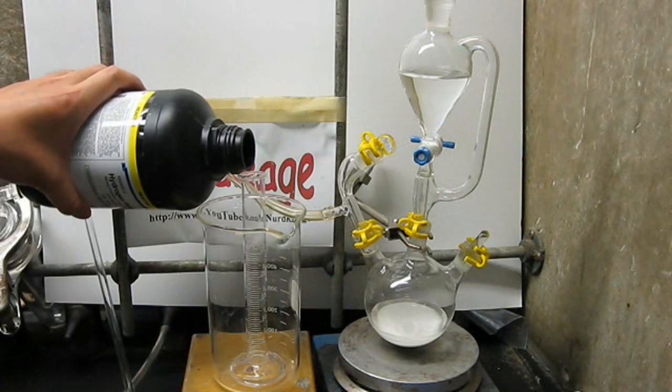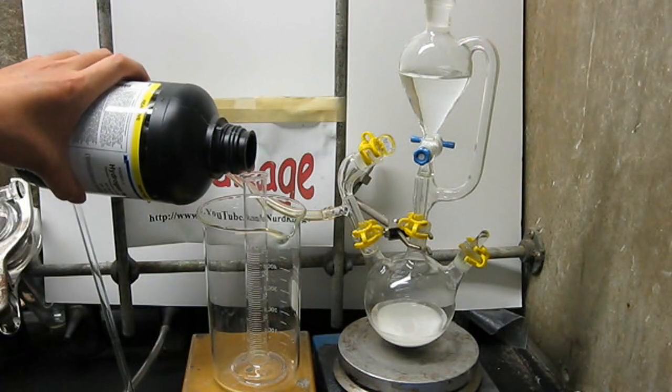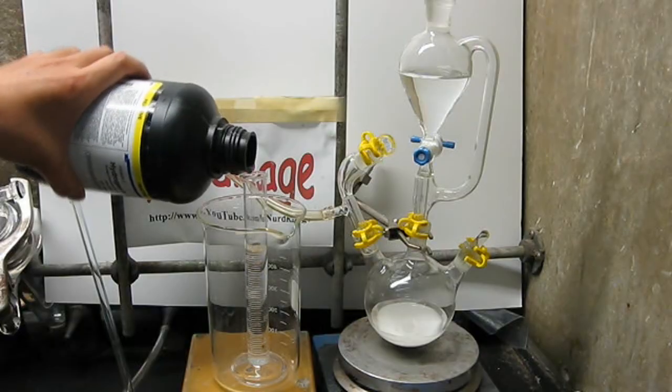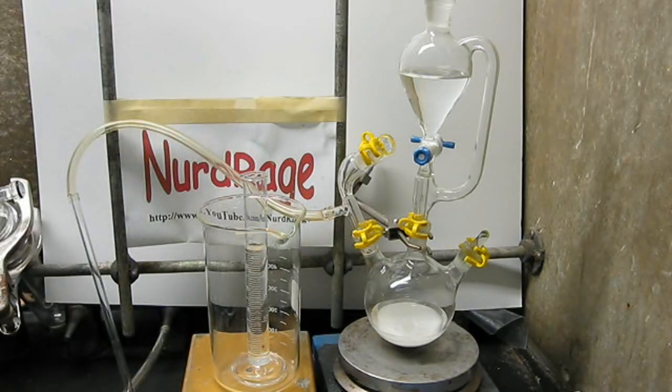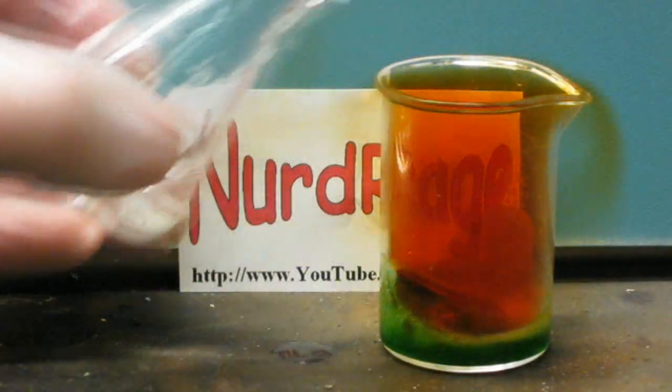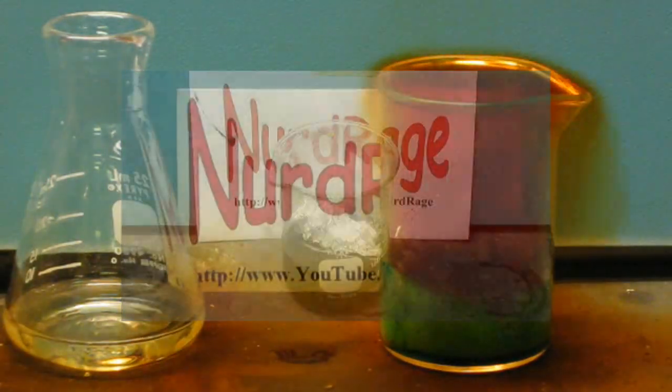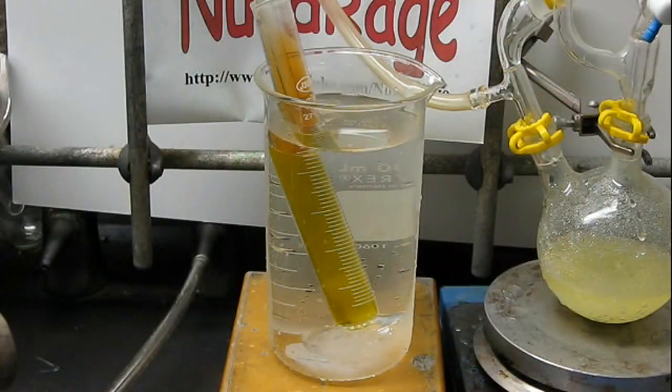Now I'm using hydrogen peroxide as the oxidizer because it's cheap and readily available, but it doesn't give a high yield or a decent concentration of acid. A better oxidizer is the concentrated nitric acid made from the first two methods we showed in our nitric acid video. A reaction with sulfur dioxide will produce copious amounts of nitrogen dioxide.